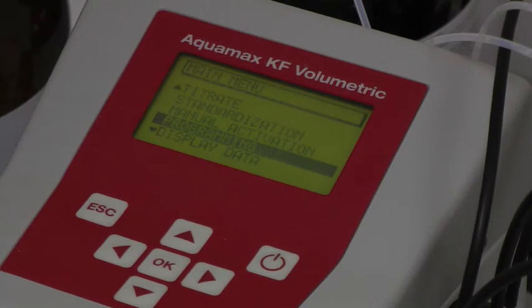When the instrument is switched on, the main menu gives access to the main titration and standardisation functions. First, though, the system must be set up using the programming option.